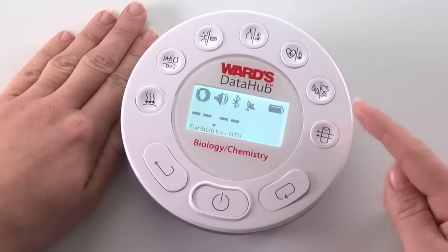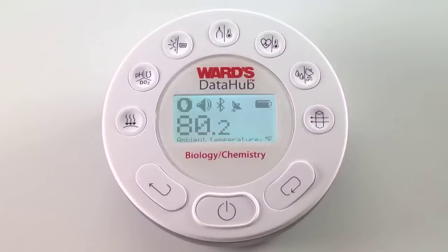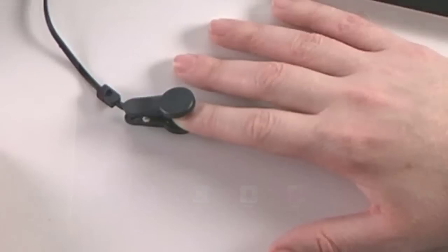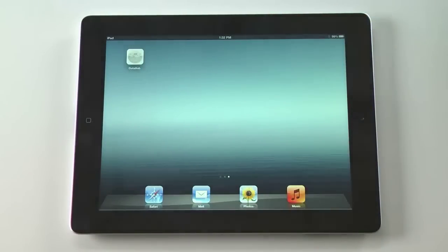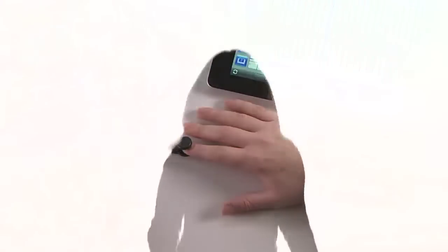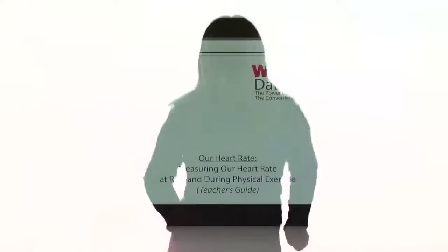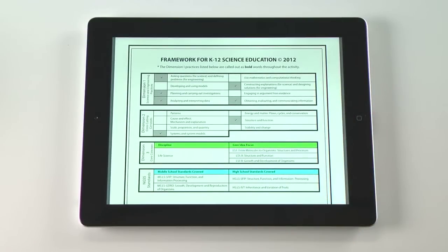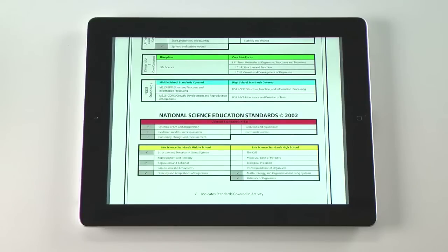In less than three minutes we can use the DataHub, the included heart rate clip, and an iPad to conduct a common life science experiment: measuring heart rate at rest and during exercise. This popular activity covers common science standards of structure and function in living systems, regulation and behavior, diversity and adaptations of organisms, matter, energy, and organization in living systems.